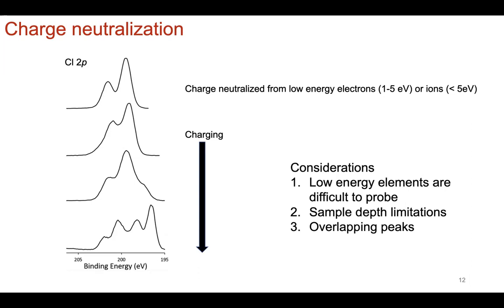that can cloud the signal and also distort the resolution. So here you see a signal from the chlorine 2p peak. So the 2p 1/2 and the 2p 3/2 here. Higher binding energy is the 2p 1/2. And so you see without charging, you see these spurious peaks that are not real, as in they're not attributed to a physical phenomenon, which is the orbital splitting. And so this can really present a problem if you're dealing with semiconductor materials, which is often the case for a lot of the battery materials.